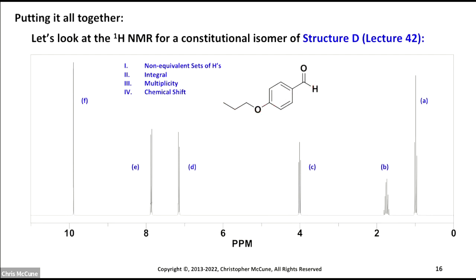All right. So I'd expect the terminal CH3, and I know also by the splitting pattern, right? Look at this. This is a triplet, and I'm going to say that's 3 hydrogens. It's a triplet because it's next to 2 hydrogens. That's peak B. So there's a relationship there. So let's call this A then, and this B. Okay. And then we go to C. C is a triplet.